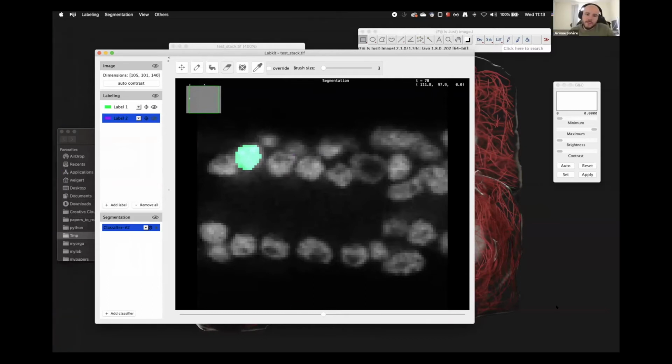I have a question. If you have a membrane staining, for example, in this case, would you draw the membrane or would you draw the... No, you would draw the interior. Okay. But you would consider it as background then, or as foreground? So you don't, that's what I'm saying. That's why I mentioned it. You don't do foreground and background. You would really do every instance, and every interior of the membrane would have a different label. So you would create a new label, add a label for every one of those instances. And you would just label the interior, right? Okay.